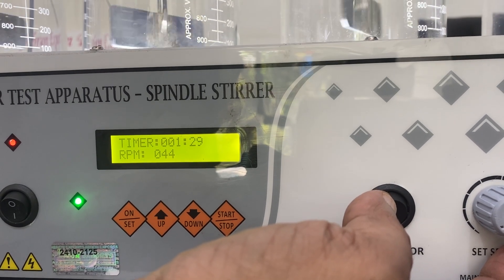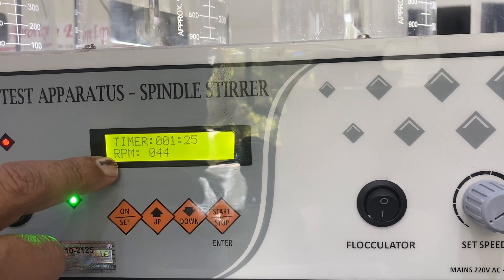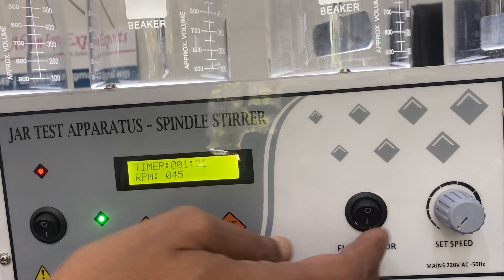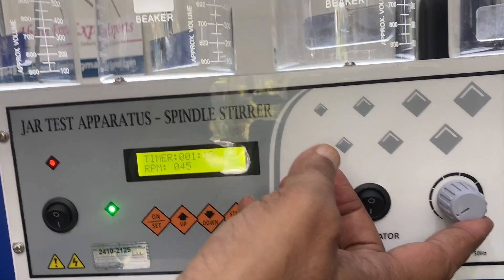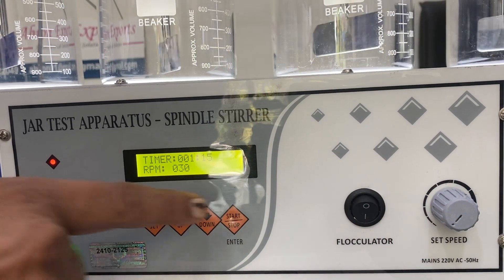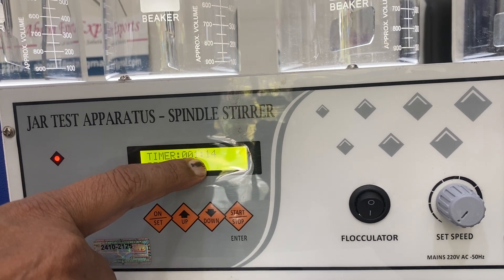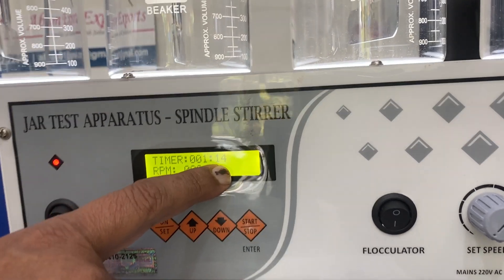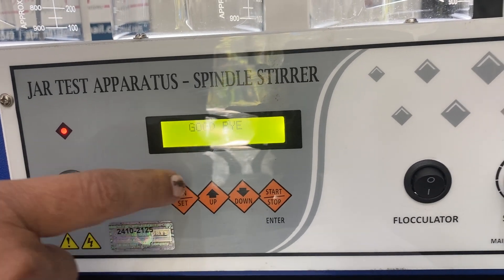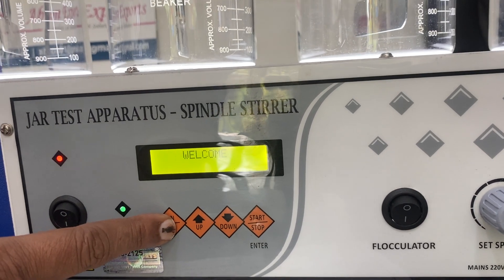It is at approximately 24 revolutions per minute. I can switch it off using the same button — it tells you switched off, becomes zero, and shows how much time is remaining out of two minutes. If I want to change the time, I switch it off — goodbye — and then switch it back on to set, say, five minutes.